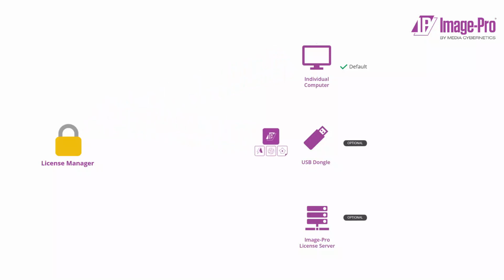When a bundle is linked to a dongle, any user of any computer to which the dongle is connected is licensed to use Image-Pro. When a bundle is linked to a license server, any user of any computer that's connected to the license server is licensed to use Image-Pro. Using the license server is covered in another video. In this video, we'll consider linking license bundles to computers and dongles.